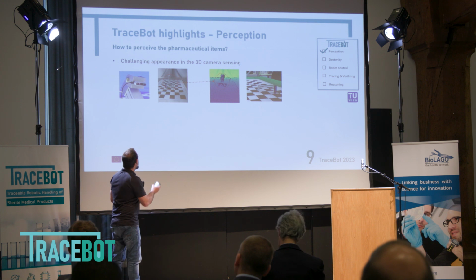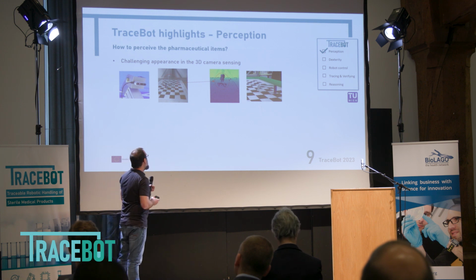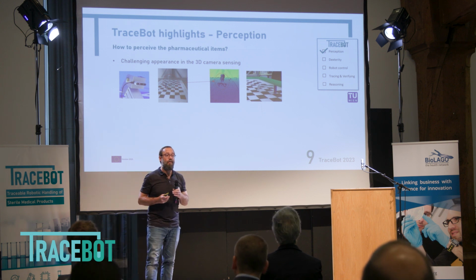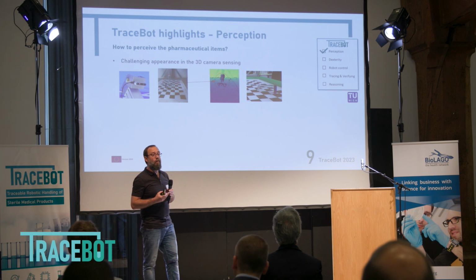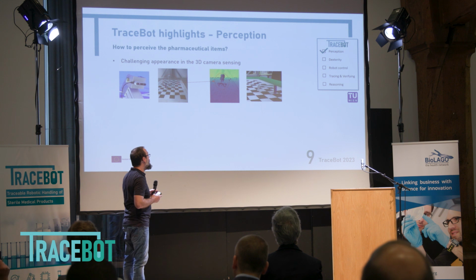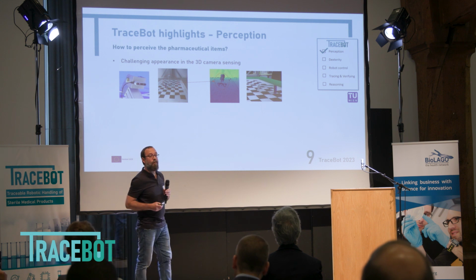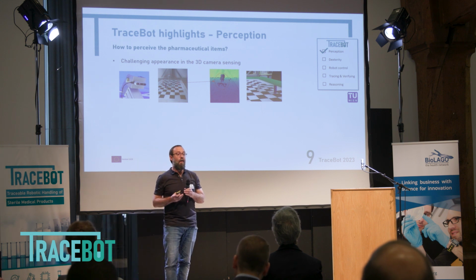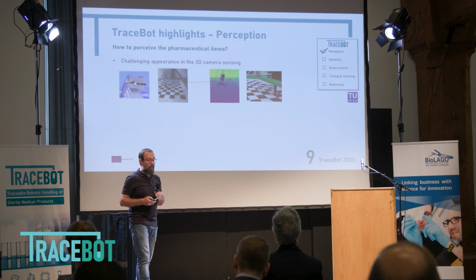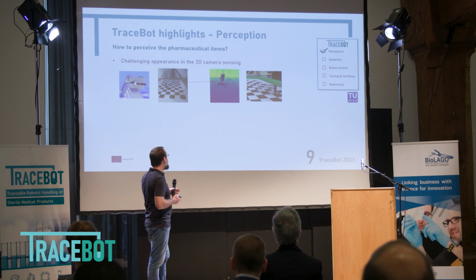And if we look at a typical laboratory scene, and you try to look from the depth image that you can get the different items, the information is not complete. The transparency makes the life of the sensor quite complex. And even if you focus on the regular RGB image, what you see is what is behind the object. So the appearance totally depends on the background. That makes the detection of such type of object quite challenging.